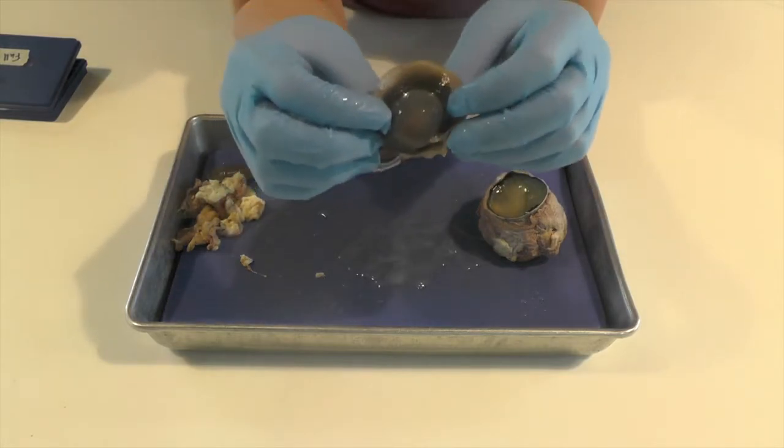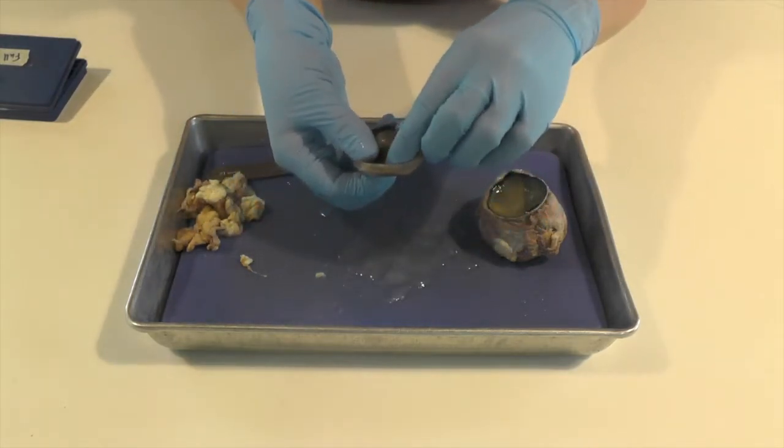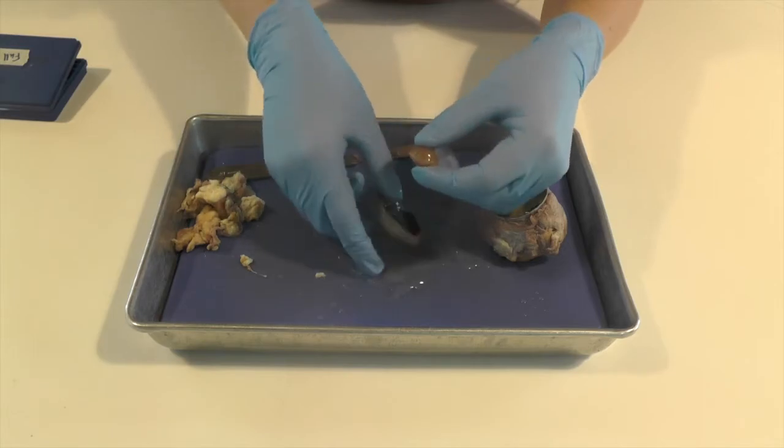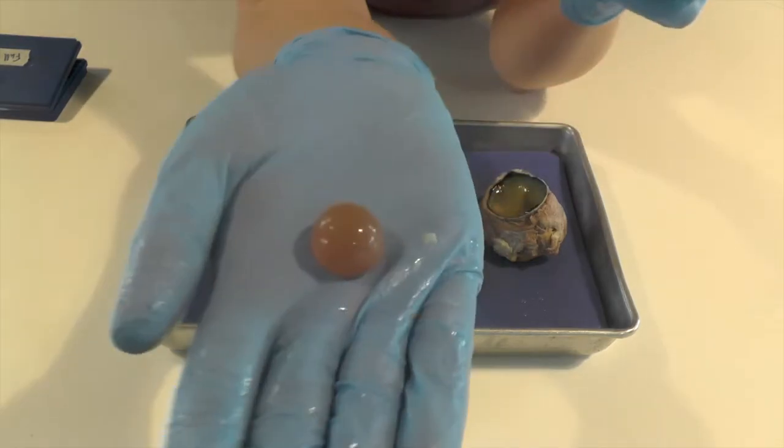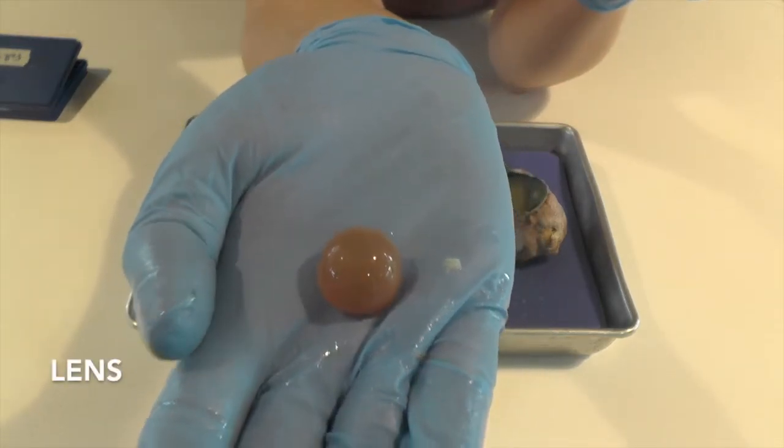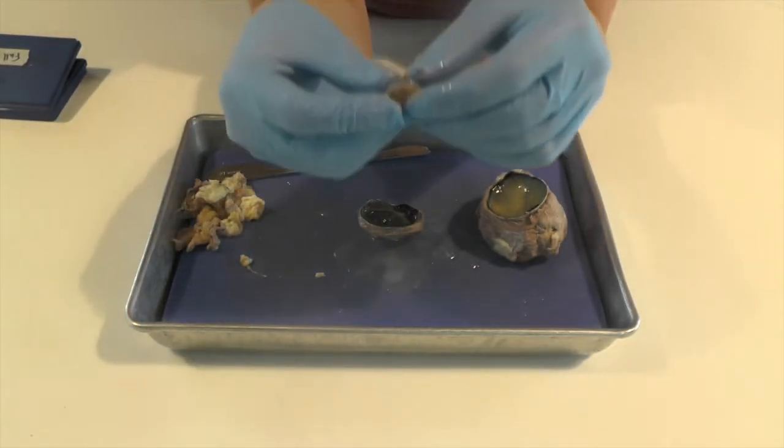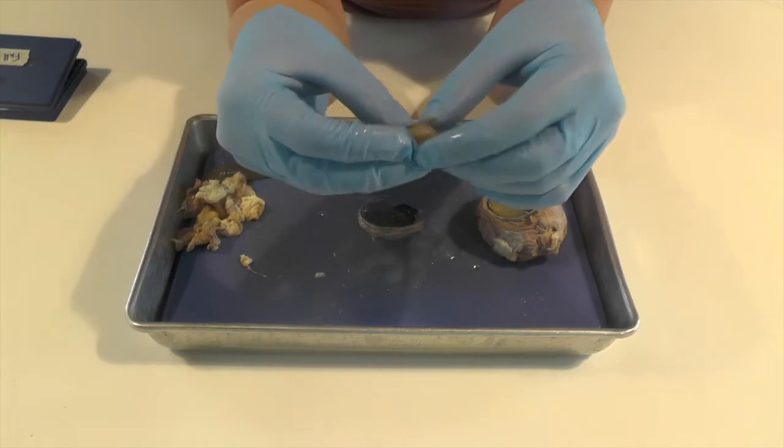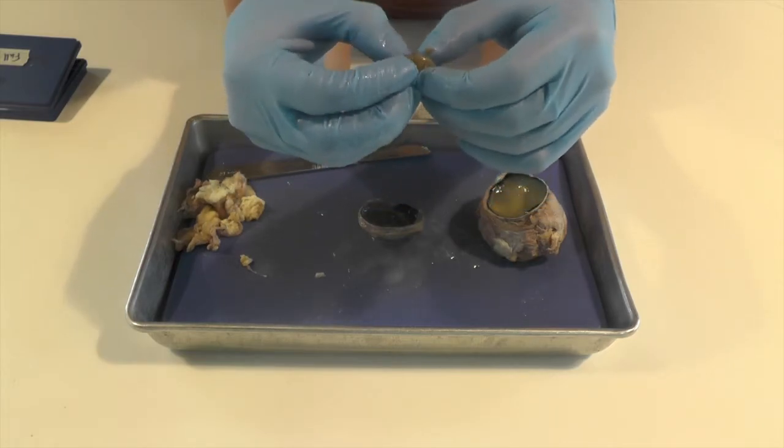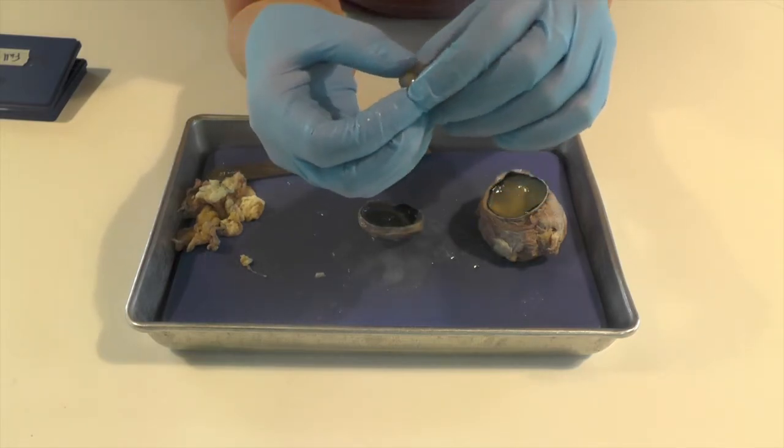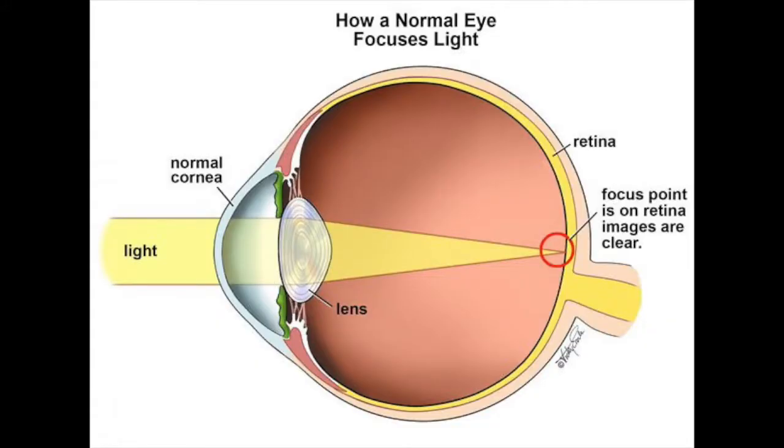So this is our front of the eye here, remember? So I'm gonna pop this thing out. And this kind of feels a little bit like an M&M to me. This is our lens. And our lens is normally not so hard. Like right now it feels very hard and cold. And our eyes aren't normally hard and cold. That's due to just how it's been preserved. But the lens helps focus light into your eye.